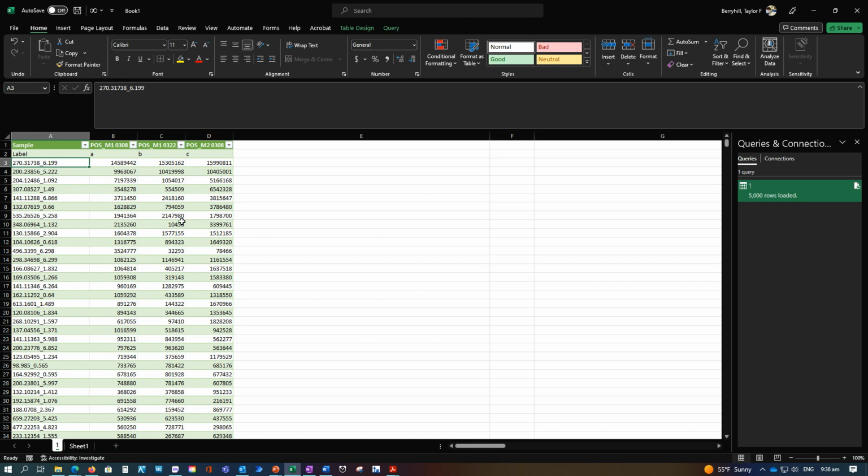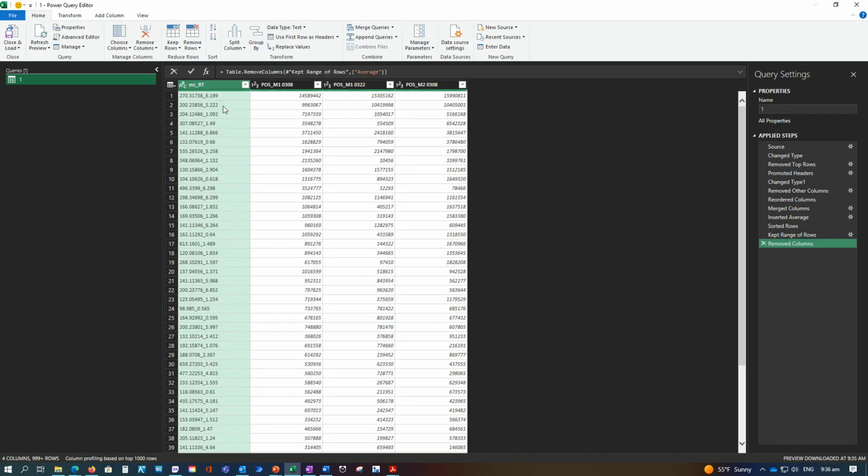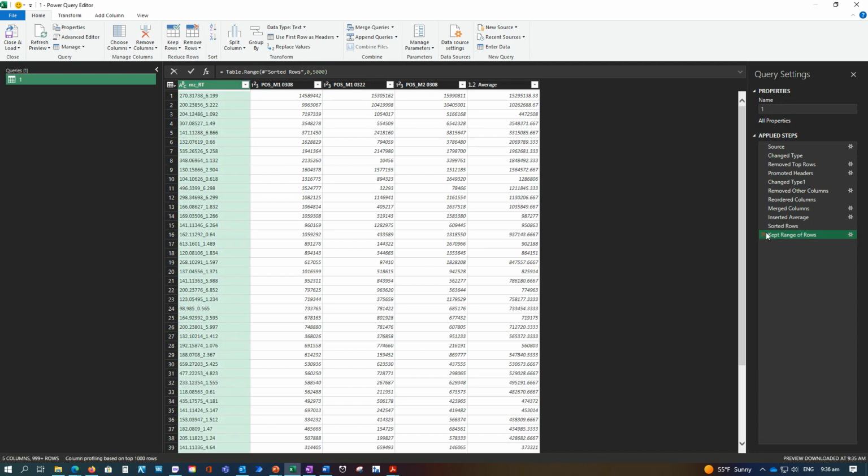There's a way you could also do this where you take the top 5,000 and then you take the next 5,000. Real quick, I'll show you how to do that. This doesn't reflect the little editing I just did, but say you did this, and we sorted the rows.